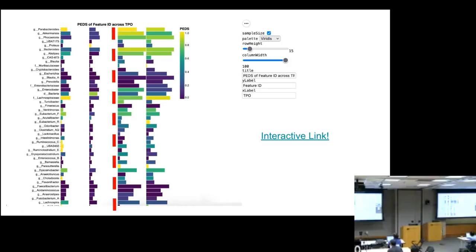And we can see, looking at it, no, it didn't. It seems like it wasn't donated to a lot of our subjects, which makes sense because Lactobacillus isn't super commensal in the gut microbiome. Let me choose something that maybe did. Lachnospiraceae. It seems like that was in our recipients prior to their FMT, but also a lot of our recipients were able to engraft this following FMT, which I think highlights maybe what might be successful microbes to engraft.